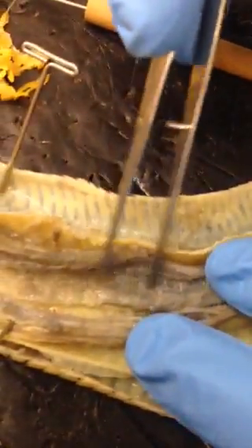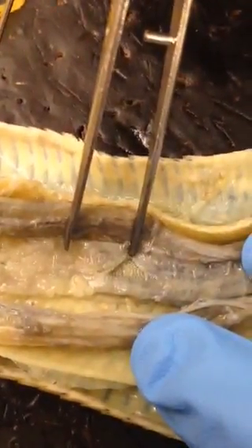If you follow the trachea, you will find the lung right here. You can zoom in and see all these little dots right here — that's the inside of the lung.